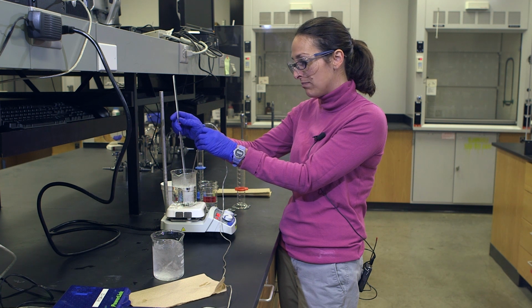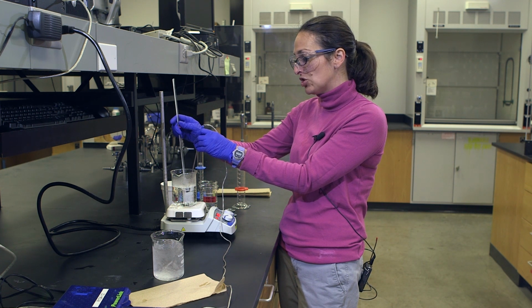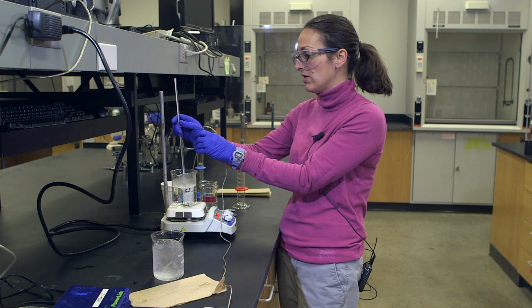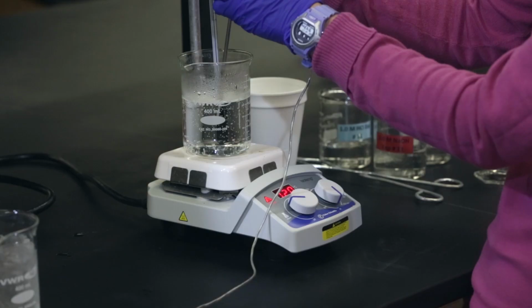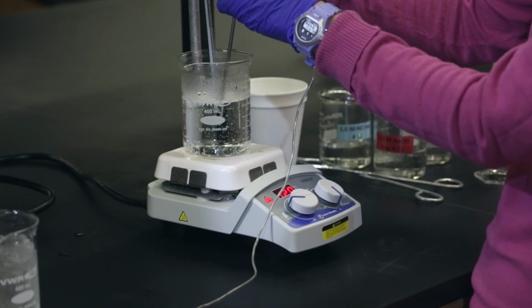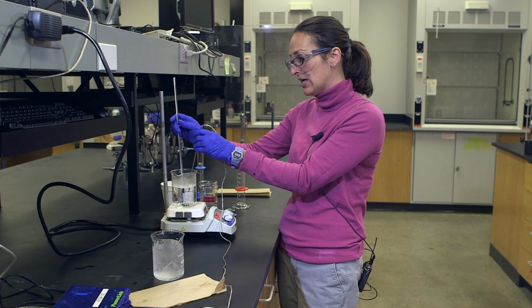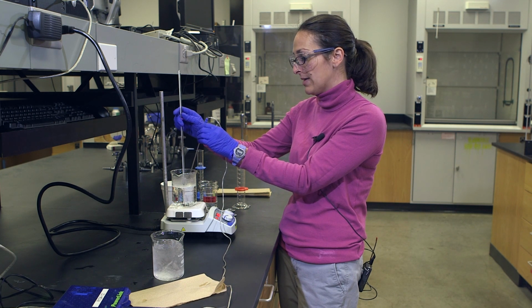And I'm going to wait for a couple of minutes, just like with my lower temperature limit. I'll wait probably 90 seconds to 2 minutes, and I'm going to make sure the temperature stops changing before I record it. Close to boiling is good. If you can get 70 or 80 degrees, a wide temperature range is going to be really useful. And once that stops changing, I'll enter in the value on my thermometer as my upper temperature limit.